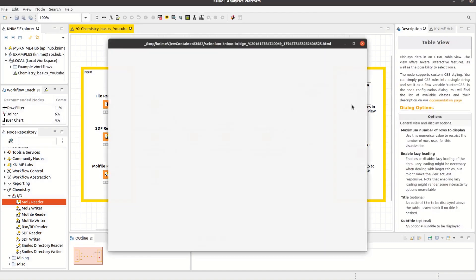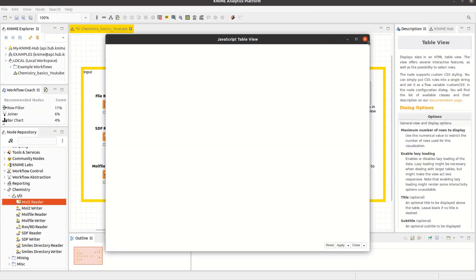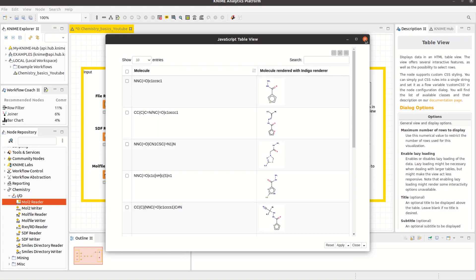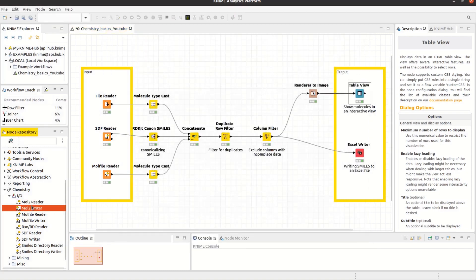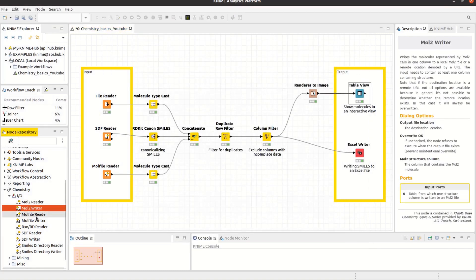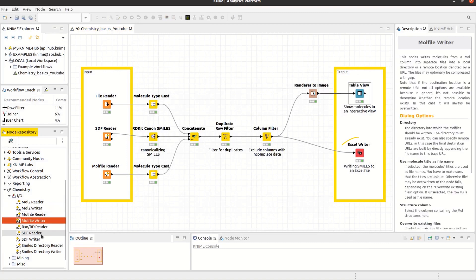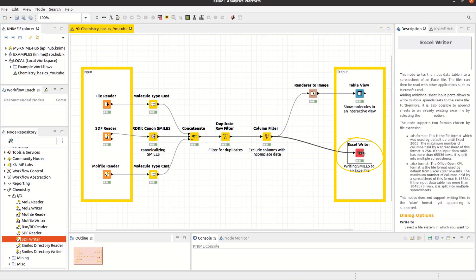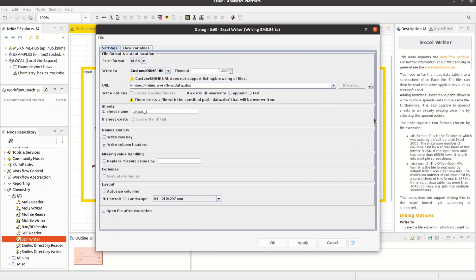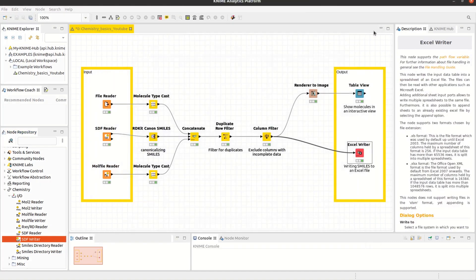Similar to the Chemistry Reader nodes, the Chemistry Base extension provides multiple writer nodes, like the MOL file, MOL2, or SDF writer node. But in case you would like to write the SMILES to an Excel file, you can also use the Excel writer node.